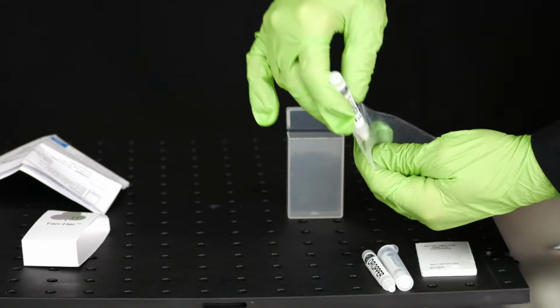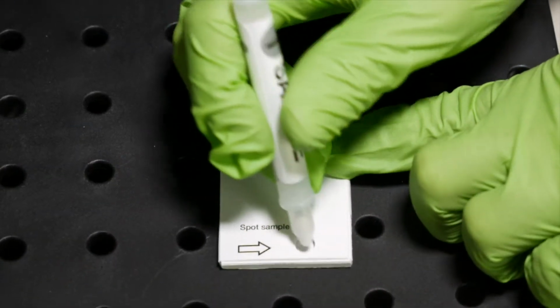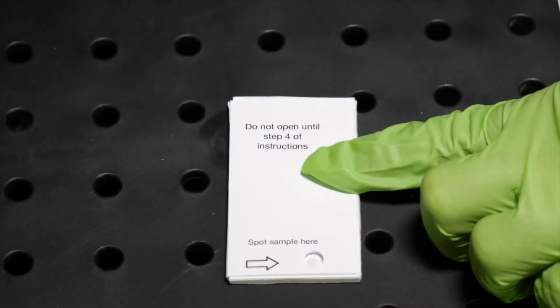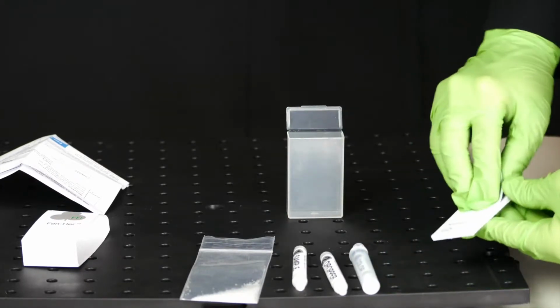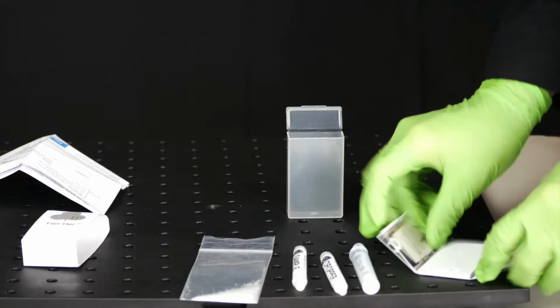Ambiguous results can be caused by too much sample on the plate. To keep spot small, dab the pen tip 3 times on the hole provided on the wrapper. Pause between each dab. Unfold the protective wrapper to expose the plate. Do not touch the white surface of the plate through this procedure.